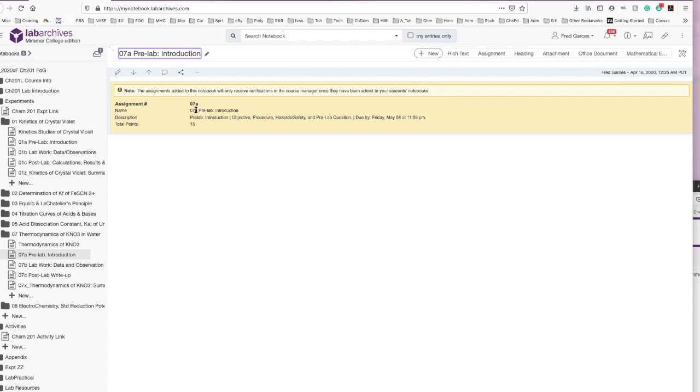And then the body of the experiment, the post-lab, isn't weighted as much. Towards the end, the body of the experiment, the post-lab is going to be weighted more than the pre-lab and the data and the discussion. But I want to walk you through so that you're concentrating in the beginning, the pre-lab, and making sure that's fine. And then towards a third of the experiment, we're going to emphasize the data and observation. And then towards the middle and towards the end, you're going to look at the post-lab. And then at the end, you're going to start your evaluative report, you're going to put it all together and make sure that you're paying attention to the write-up for that.